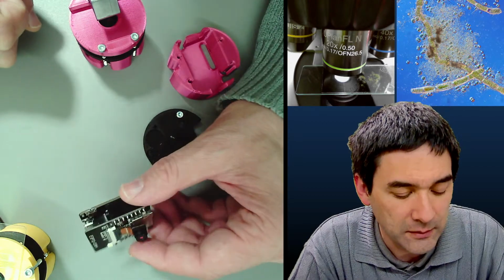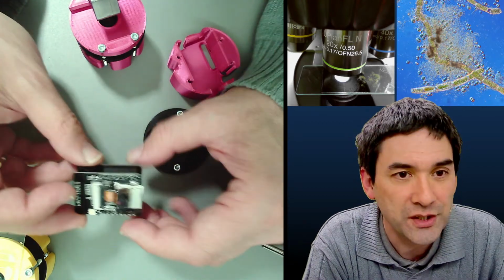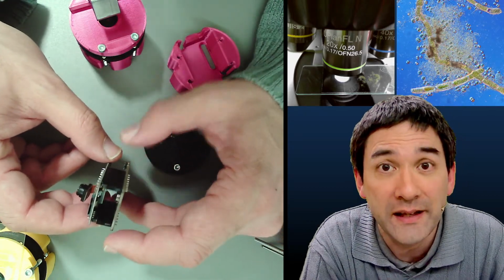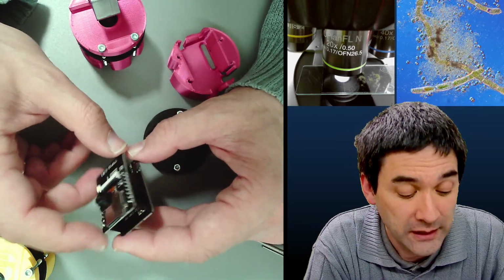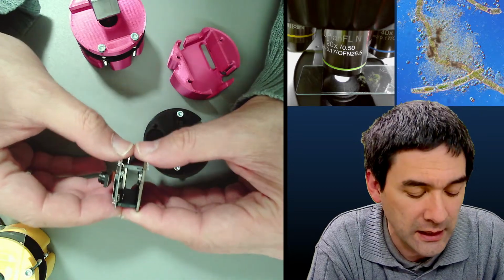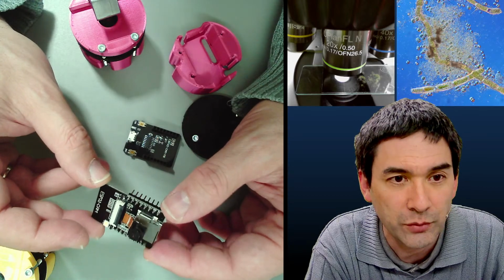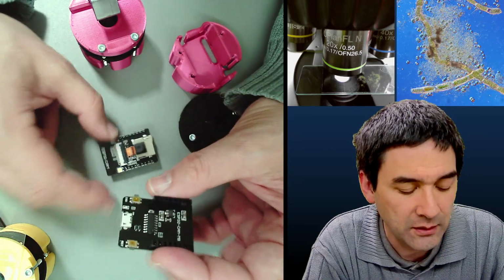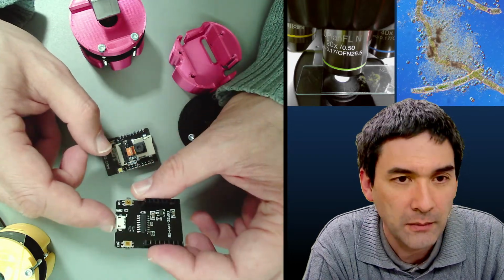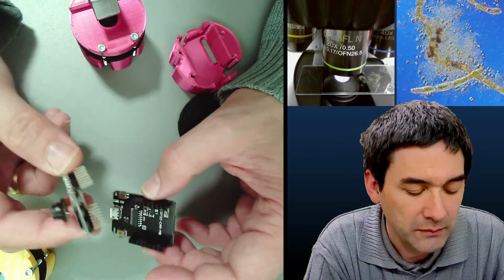So basically, this is a very nice project. How much does it cost? You can buy this online over AliExpress, which is a Chinese supplier. And the camera module over here, just the top one, because you can detach it, costs €6. That's around $6 or $7 US. Just this one over here. And this one is the main board, so to say, which contains the USB connector, and this one costs, I think, also around that much. So it's fairly cheap.